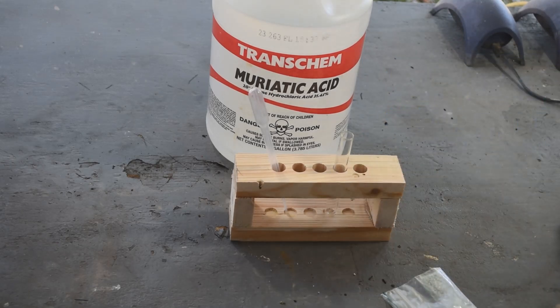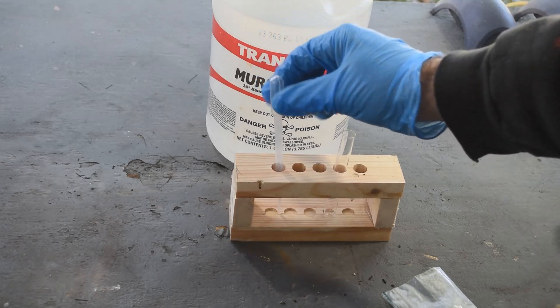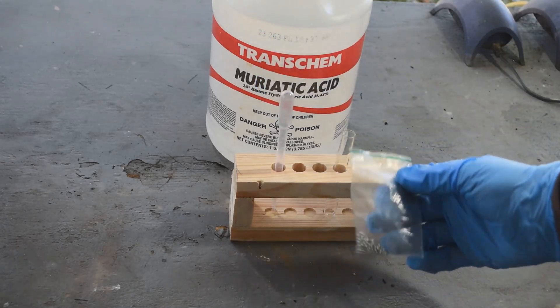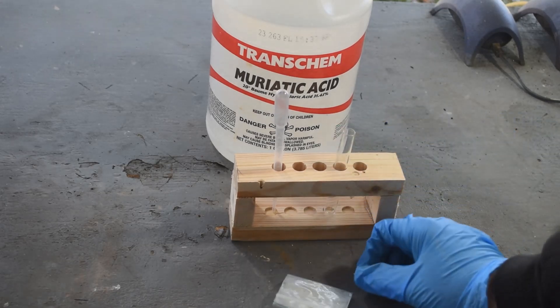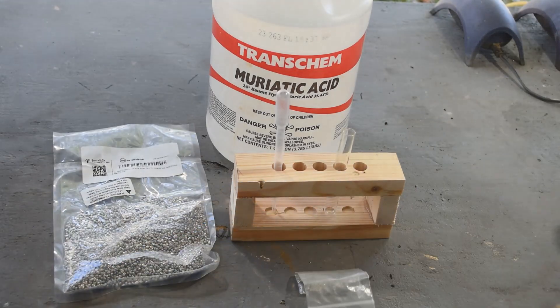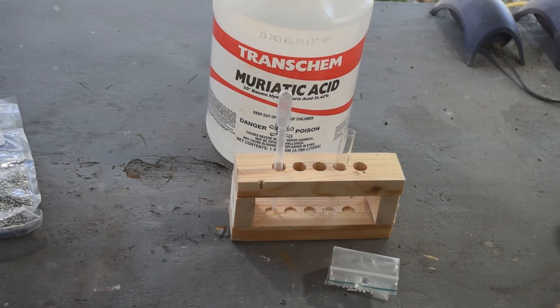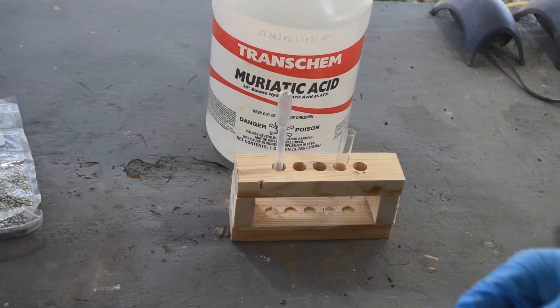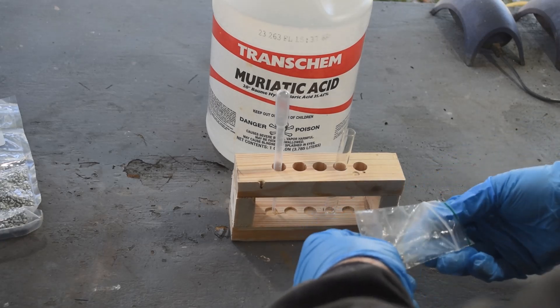So I figured out a sort of on-demand method for making a little bit of stannous chloride when I need it. So how am I going to do this? You need a little test tube, a pipette, and some tin. I've got here some pure tin shot — looks like my stock's getting a little low, but I have more. And you need some muriatic acid. I'm going to take four or five of these little bits of shot.